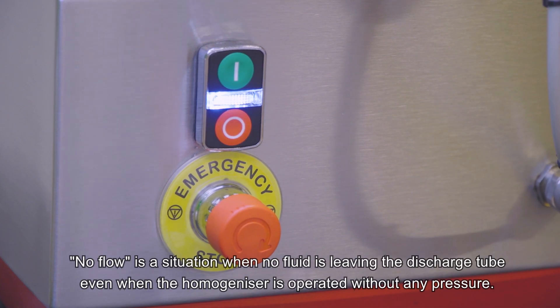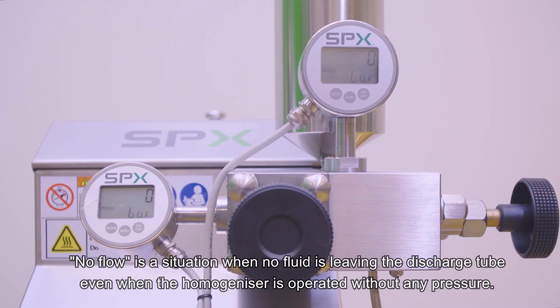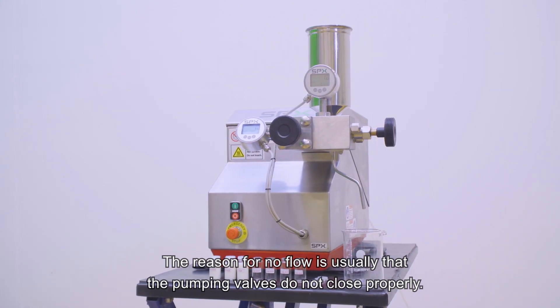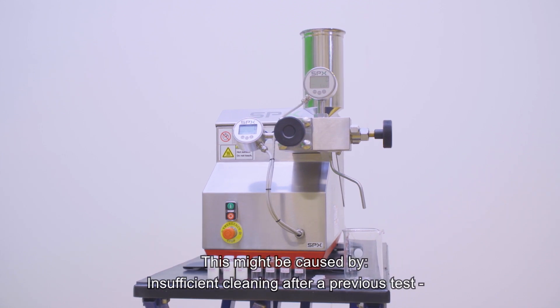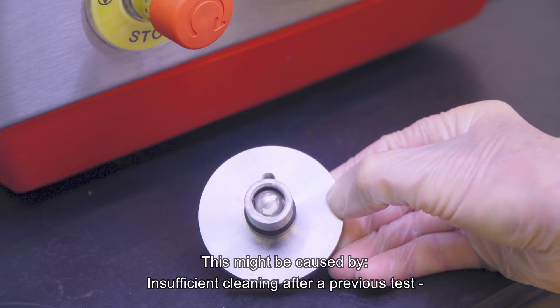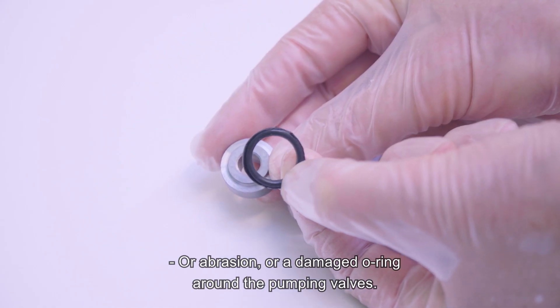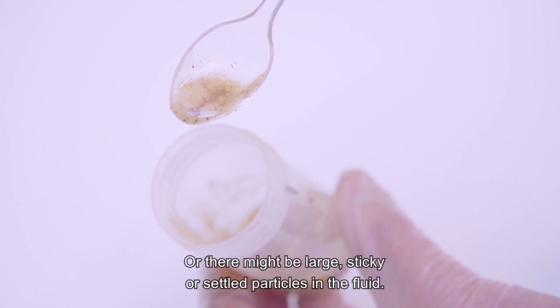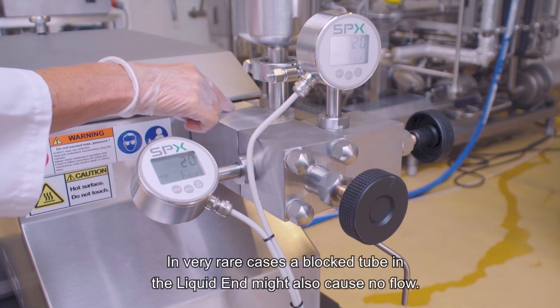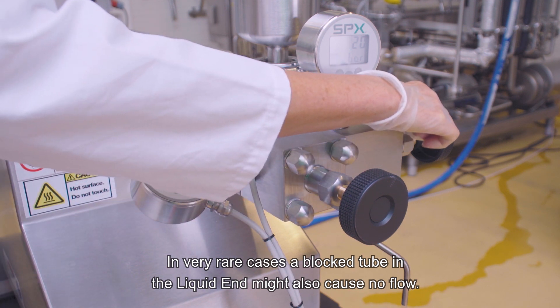No flow is a situation when no fluid is leaving the discharge tube even when the homogenizer is operated without any pressure. The reason for no flow is usually that the pumping valves do not close properly. This might be caused by insufficient cleaning after a previous test, or abrasion, or a damaged O-ring around the pumping valves. Or there might be large, sticky or settled particles in the fluid. In very rare cases, a blocked tube in the liquid end might also cause no flow.